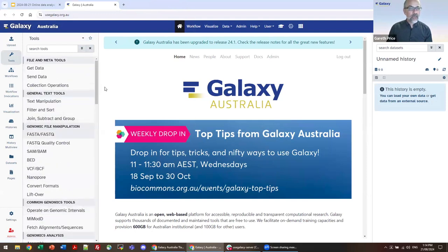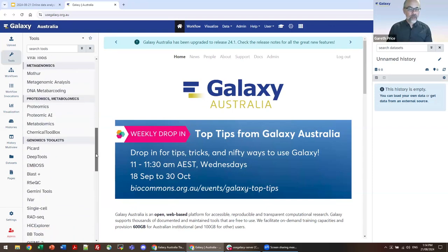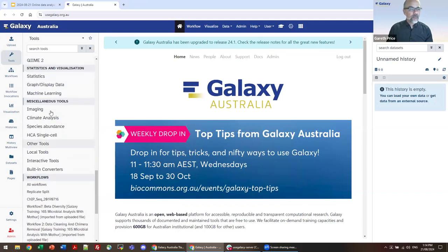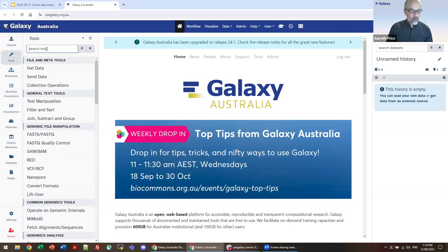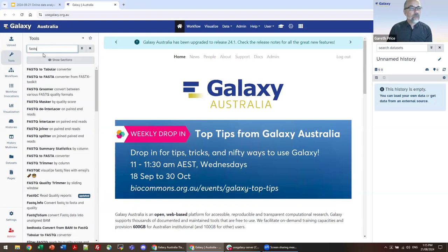Tools are broadly grouped by activity: text manipulation, genomic file manipulation, genomic analysis, proteomics, and so on, with some quite fascinating growing tool sets in image analysis, climate analysis, etc. When you want to search for something, the best way is not to try and guess what category it is. This is a context-sensitive typing menu — just type in the activity you want and it will filter to the tools you need.